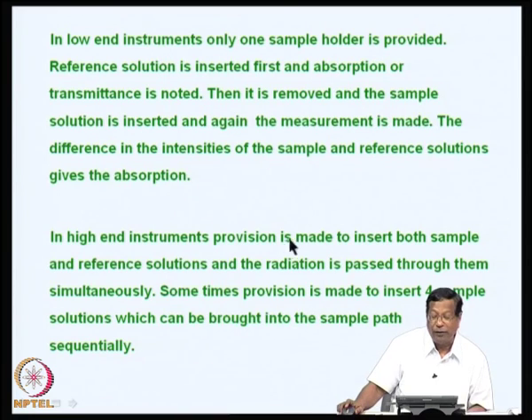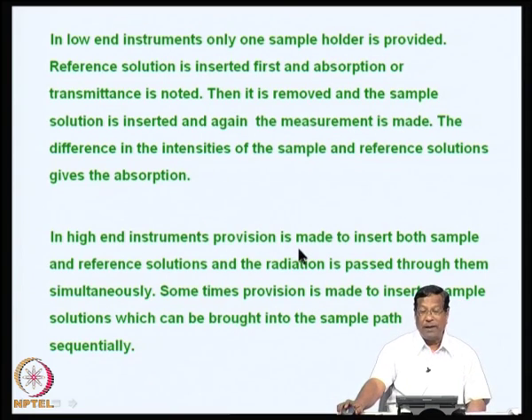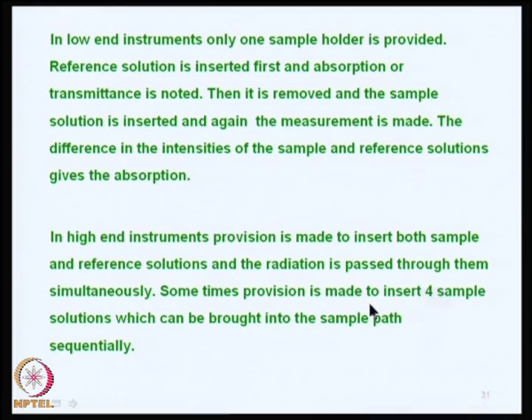In high end instruments, they put both the sample and reference solutions, and the radiation is passed through them simultaneously. Sometimes provision is made to insert 4 sample solutions, which can be brought into play as and when we need.